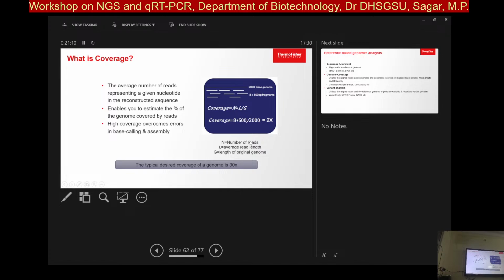How much data should be generated? I get that question often. So when I'm thinking as a whole genome, de novo, I like to think, okay, can I generate 2 million reads which have a mean read length of 300? What would be the MB generated? Right?